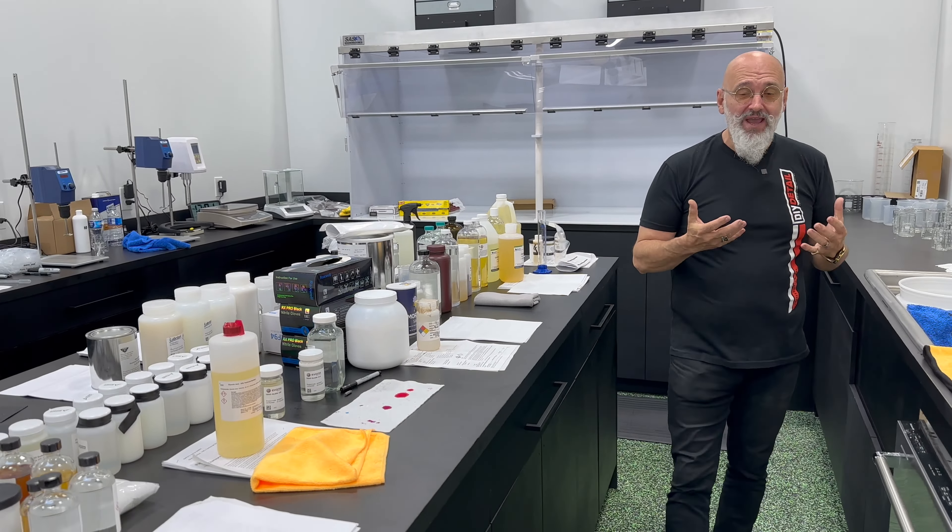Different mixing products. As you can see, the humidity and temperature is controlled in the building. We have humidity and temperature for outside, and then humidity and temperature for inside. That way, when things are mixed, they work every time.